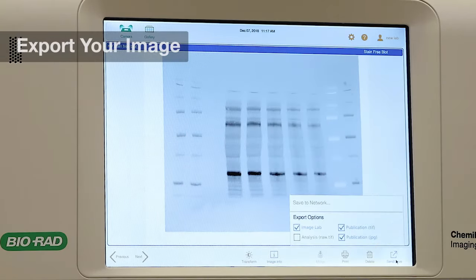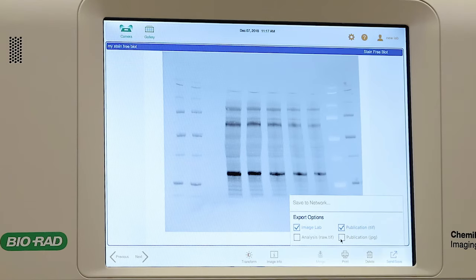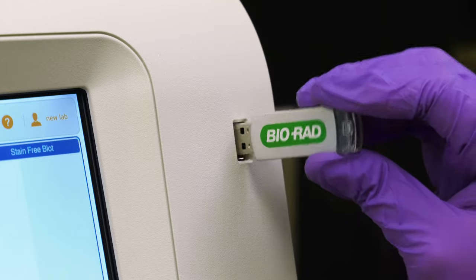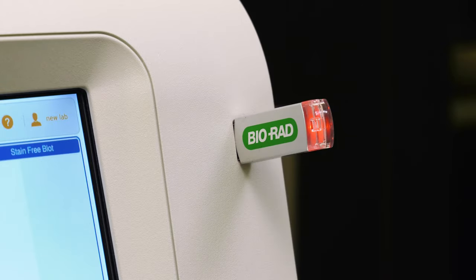Tap the send save icon to select the file format you wish to export. You can export images in multiple file types. Under export options, tap a file type and the destination, either saving to a USB drive or to a network.